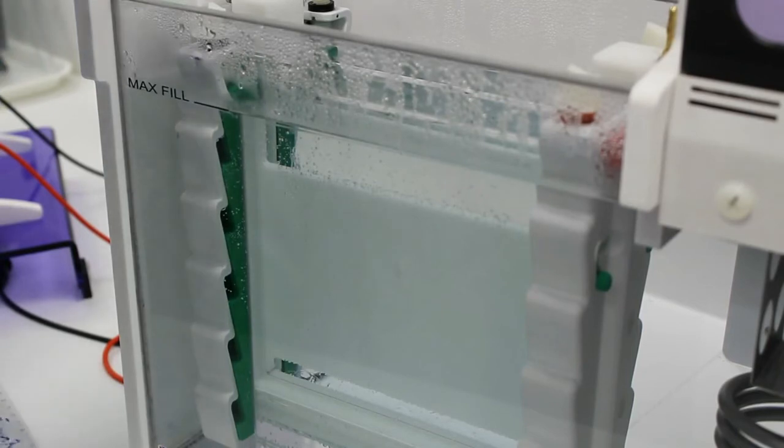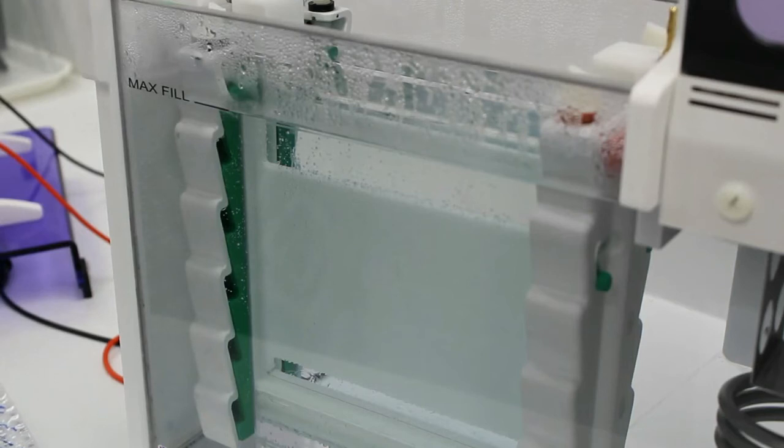You'll notice when you take the lid off the tank to load samples the heating will cut out because there's a magnetic switch in there that prevents the moving parts from going while the lid's off.